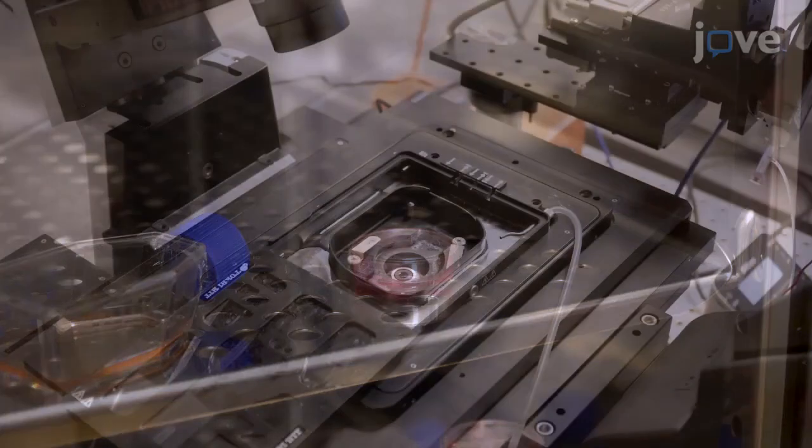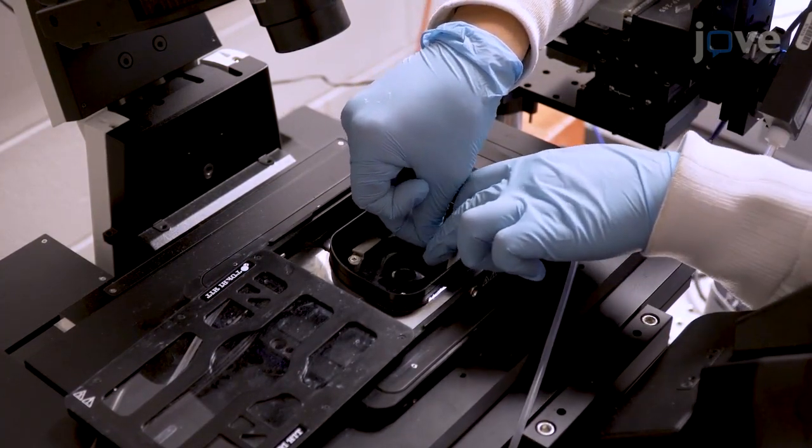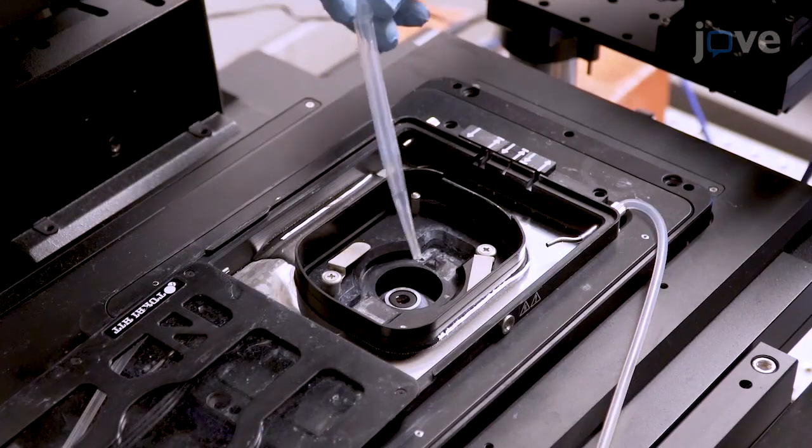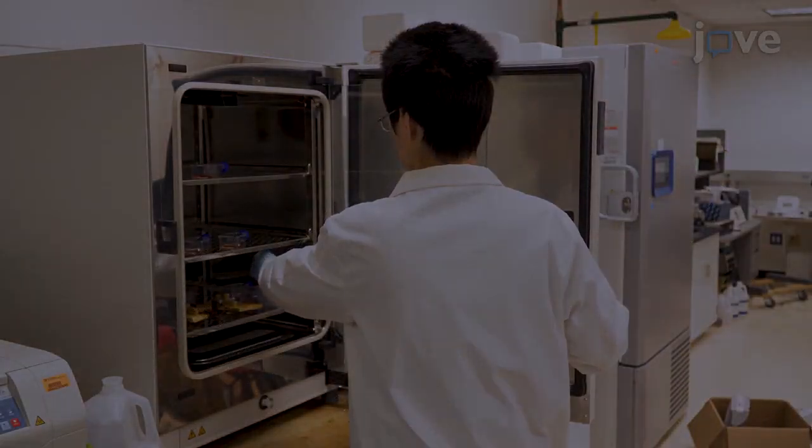Cut 2 small pieces of adhesive tape and stick them on the chamber around the circular hole. Then, apply a little adhesive glue onto the area of the tape that the petri dish will cover. Take out the petri dish from the incubator.